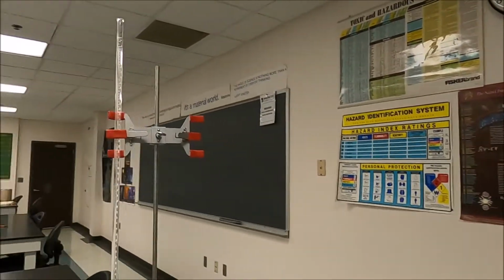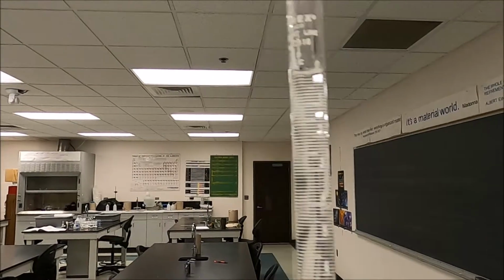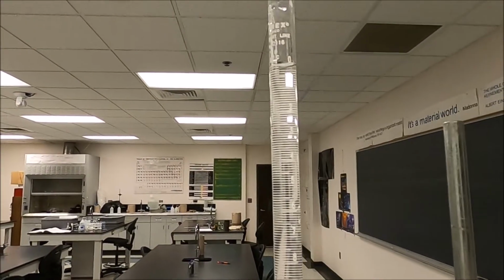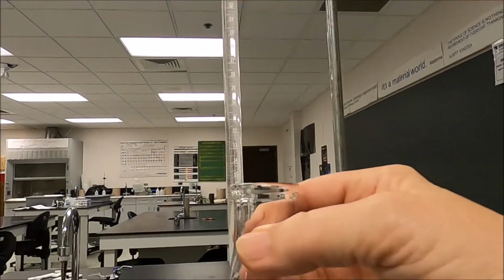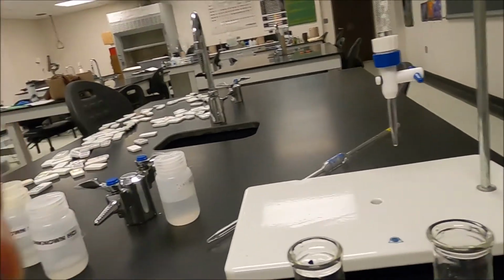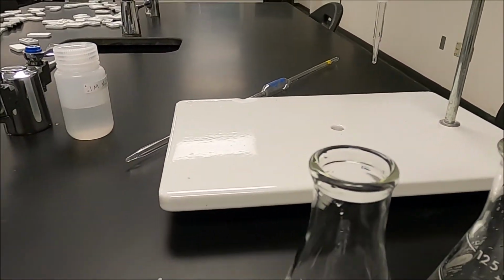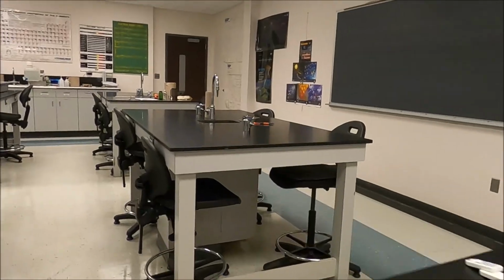Okay guys, this is a burette. I'll get up here close so that you can see. Now this burette is filled with sodium hydroxide. And it's a to-deliver instrument, so we read from the top down, okay? So if we look at this, our starting volume of NaOH is 0.00. Now in the Erlenmeyer flask, I have my HCl solution, and we're gonna add an indicator to each one, okay? Now the indicator is clear when it's in HCl, and it will be pink when we're in NaOH.